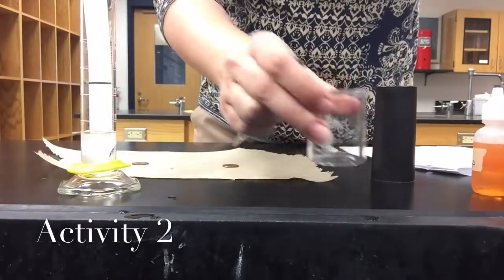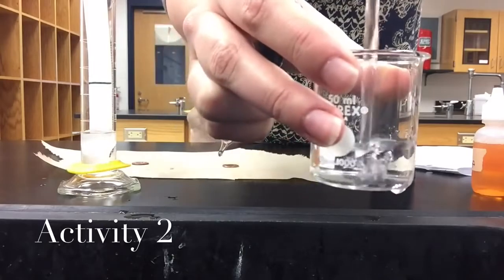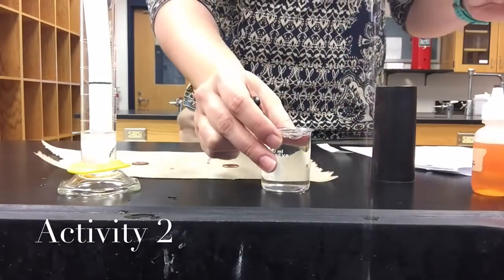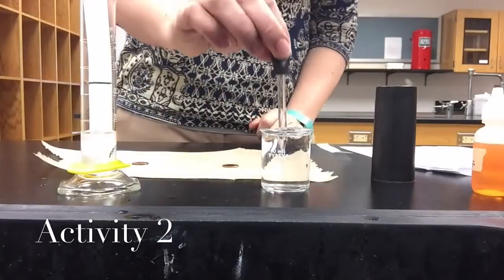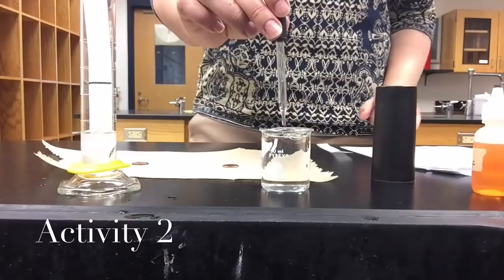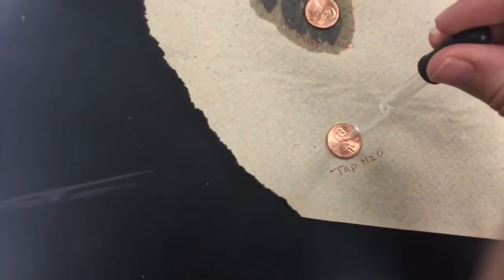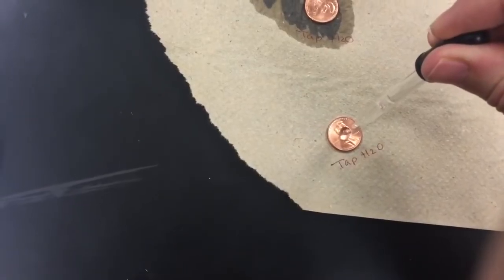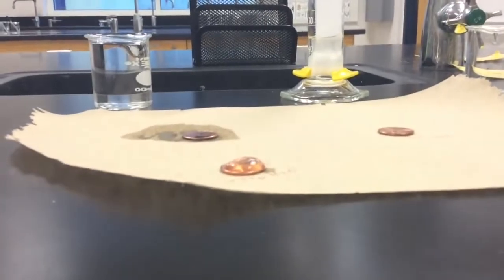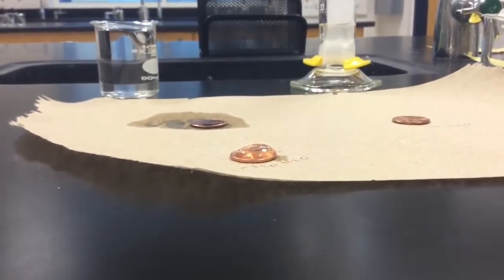We're going to use some water from the tap, and what we are going to do is put drops on the penny until it overflows. When you drop, you want to make sure that you are straight up and down. One, two, three, four - here's a side view of what the penny looks like with drops of water on it.